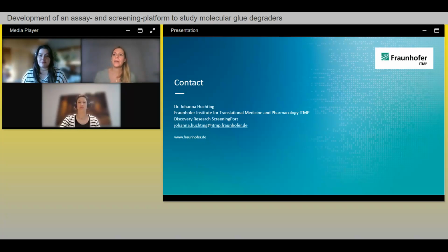Thank you for the question. So the HTRF has much less hands-on time than a Western blot. You don't need to do protein amount estimation and so on. So what takes most of the time is actually the lysis of the cells and then the transfer to the 384 well, and then adding the antibodies. That's basically the 3 steps that you will do. And then you incubate this overnight. So depending on plate numbers and whether you have an automation that will do your plate handling, for me, usually I have 1 to 4 plates, and I do not use an automation for 1 to 4 plates. So the pipetting part is around 90 minutes, and then the day after, it's basically just putting it in the plate reader and waiting for 2 minutes for the result.